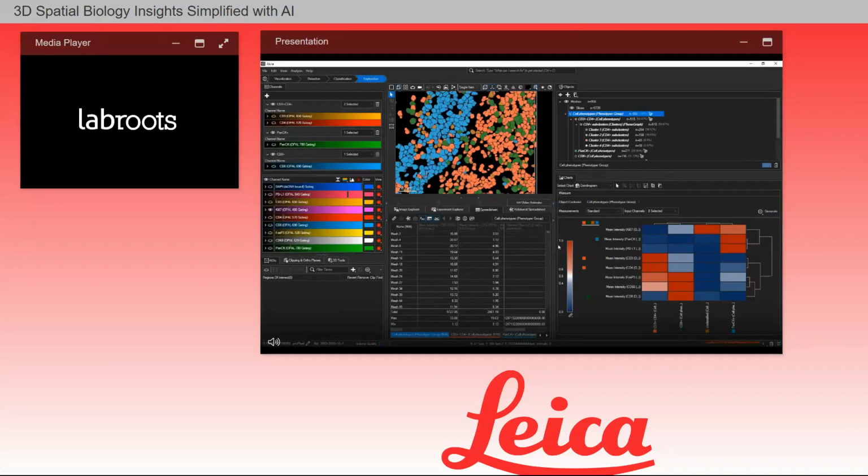With Aivia 14, we are measuring the nearest neighbor based on the closest vertex-to-vertex distance between object meshes, as opposed to the centroid of these objects. This gives us a much more accurate representation of the relationship between object sets.